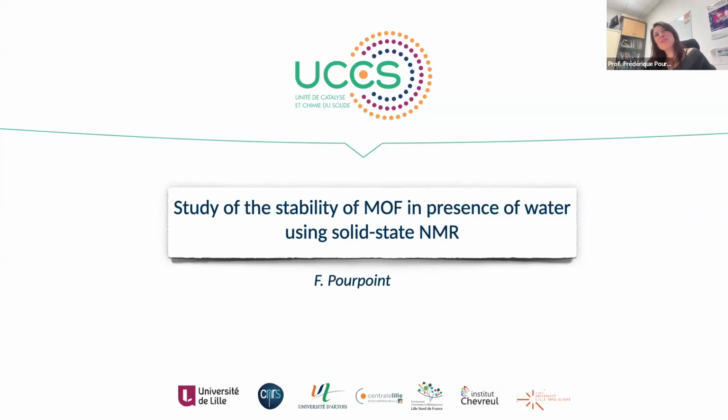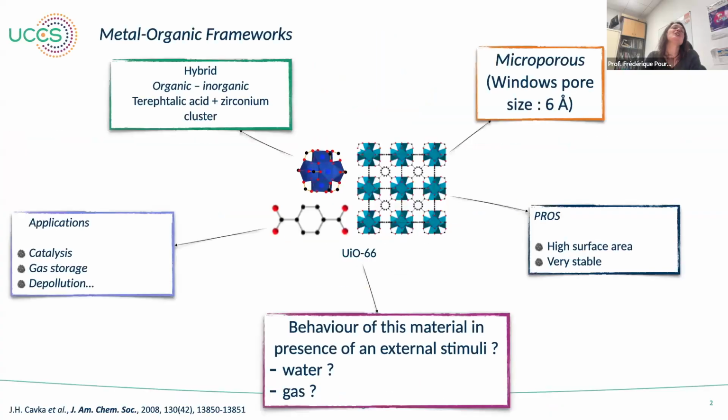I'm going to talk about the stability of MOF in presence of water, and I'm studying that by solid-state NMR. First, as a quick introduction about metal-organic frameworks, they are hybrid compounds, mixed between organic and inorganic components. In the case of the UiO-66, the samples I will talk about today, it's made of terephthalic acid and a zirconium cluster.